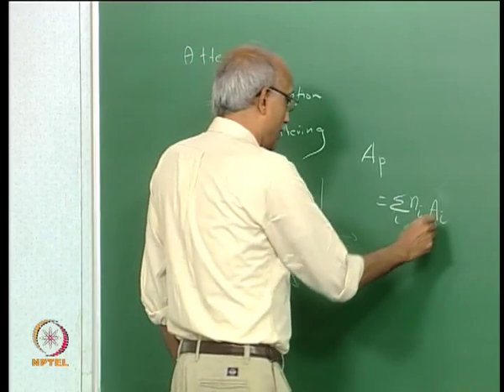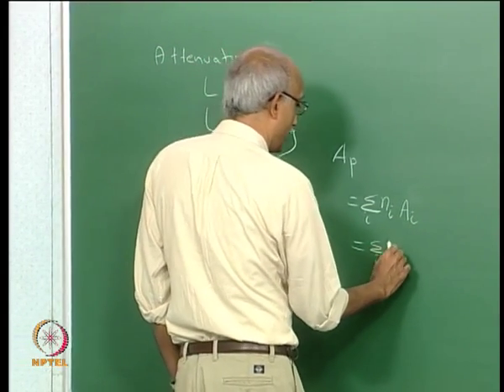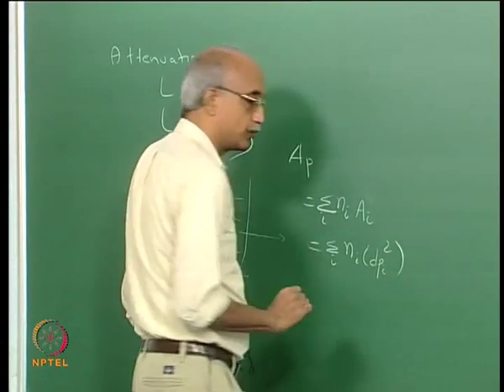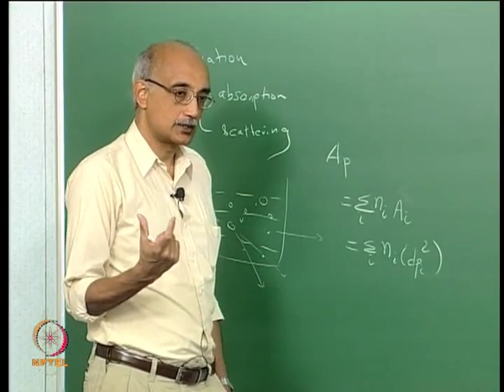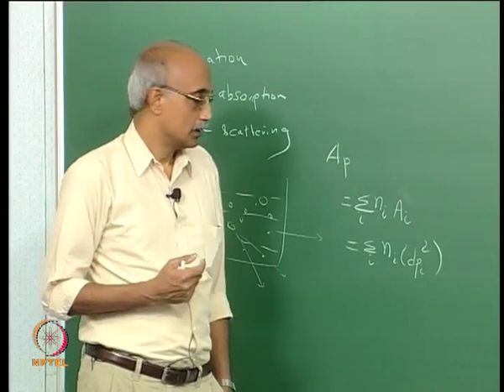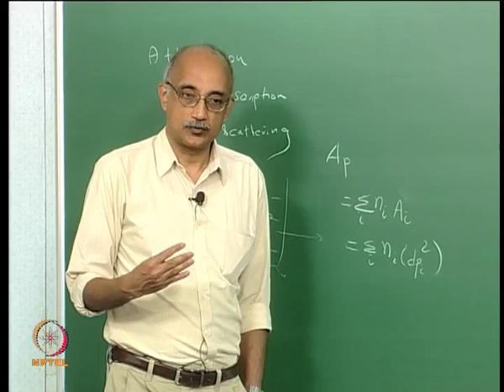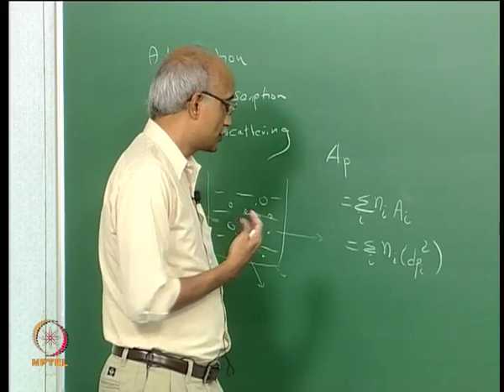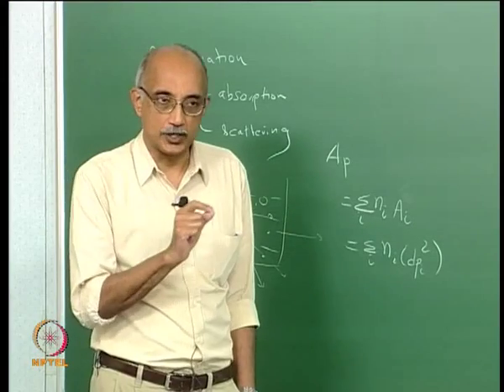Now, this A_i of a particular particle is roughly proportional to the particle size squared, assuming that the particle is spherical in nature or can be represented by a sphere of equivalent scattering characteristics. And so, particle size here is not directly measured.